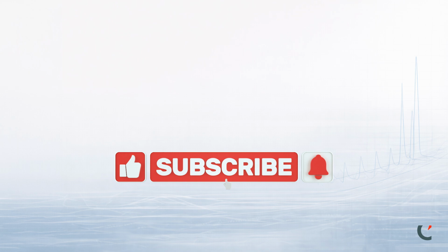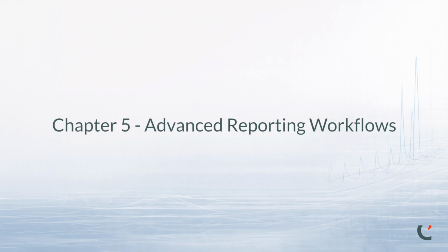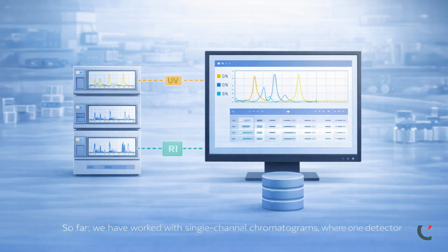Up to this point, we have focused on how formatted reports are created and how they are output. In this chapter, we now look at how those reports are used in more advanced and real-world scenarios. One important extension of reporting is the ability to work with multi-channel data. So far, we have worked with single-channel chromatograms, where one detector produces one set of results.